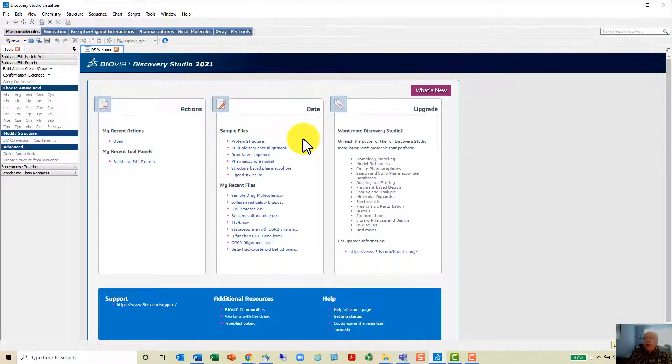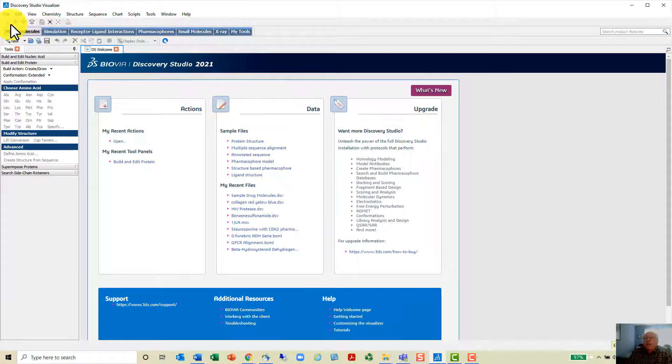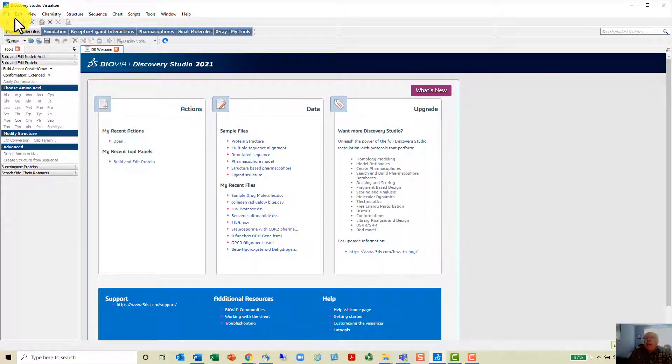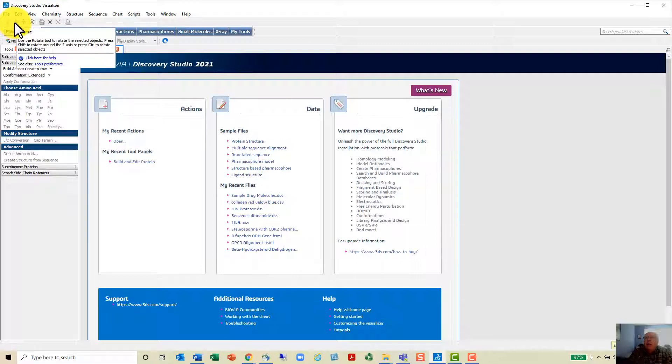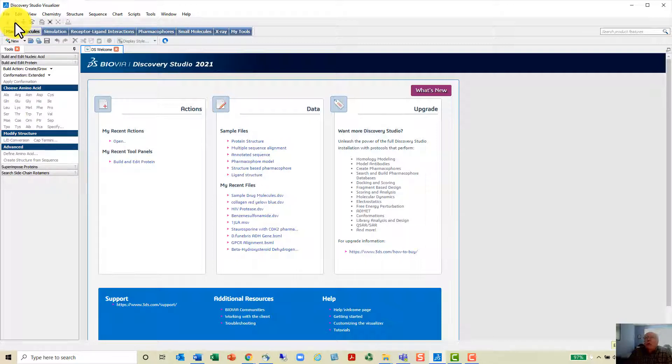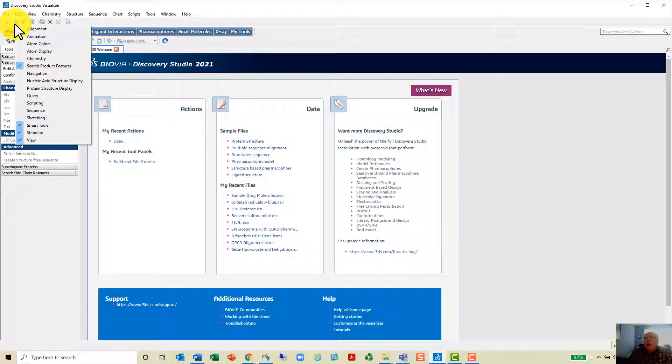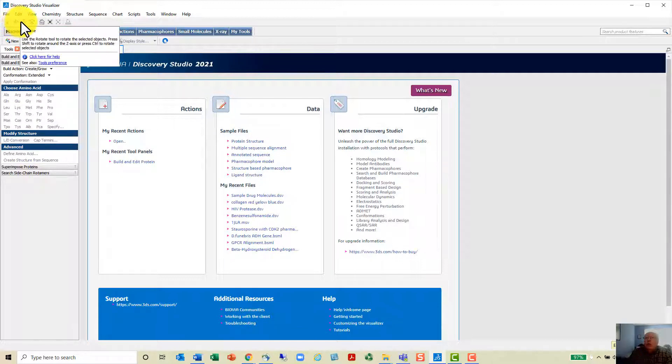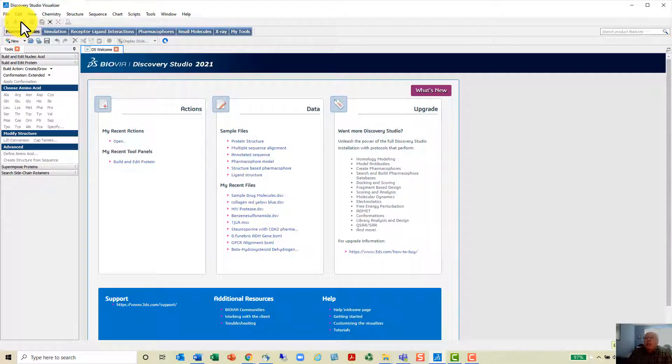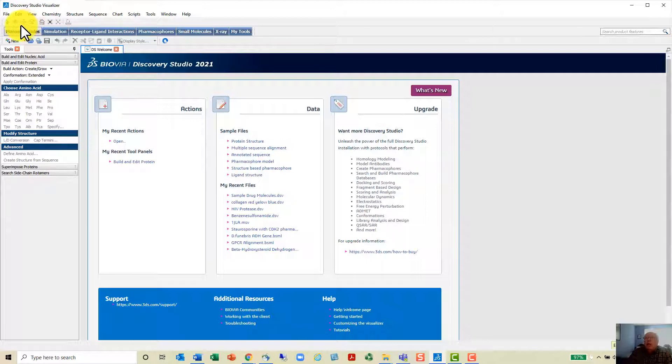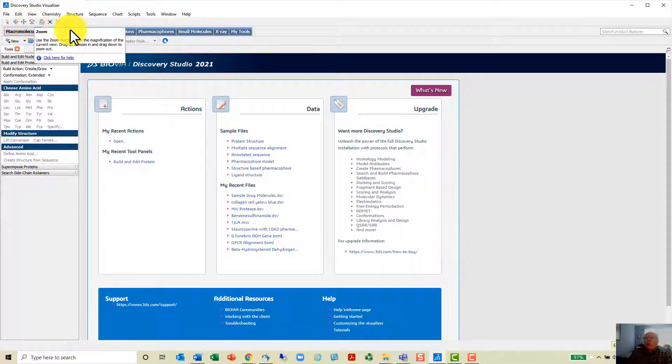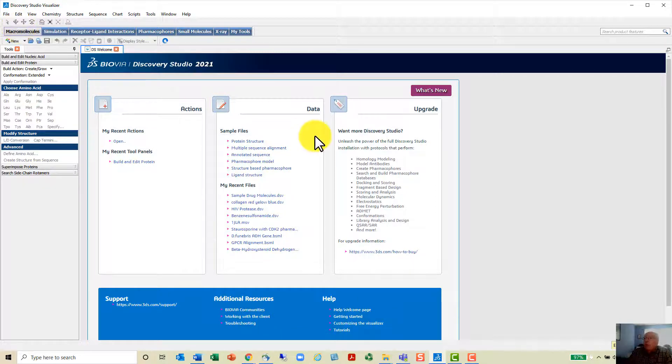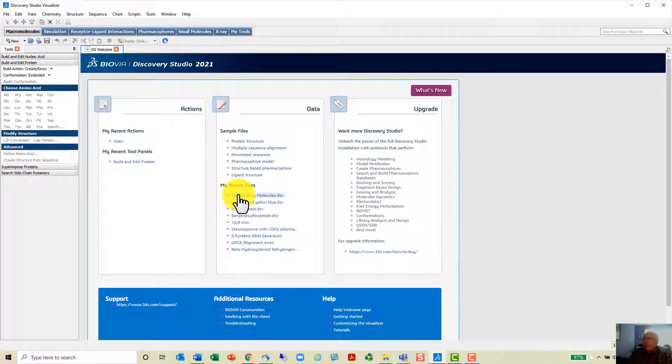There are a lot of tools that they add in if you buy the package. I like the view tools very much. The view tools provide a pointer, another tool here for moving molecules around the screen, this one's a tool for translate moving them up and down back and forth, this was a zoom tool, but this one right here is the one that I use the most, the rotate tool.